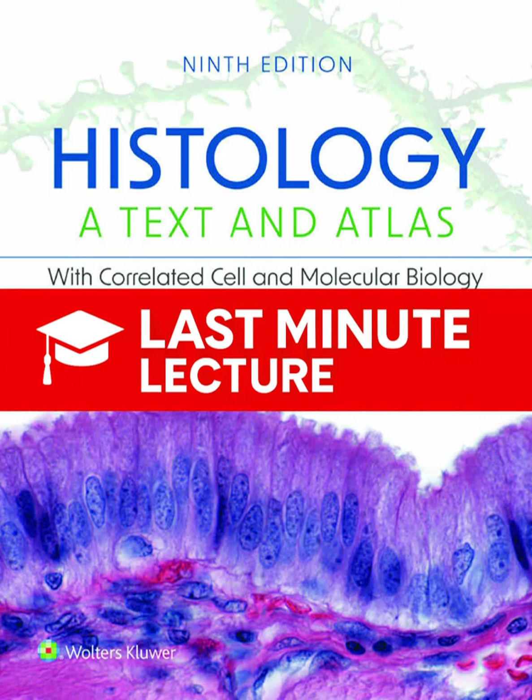The central innovation is the detector aperture, or pinhole. It's placed in a position that is conjugate or confocal with the focal point of the objective lens. And why is that pinhole so powerful? As you can see in Figure 1.13, that pinhole acts as a spatial filter. It physically blocks all the light that's scattered or emitted from structures above or below the focal plane. All that out-of-focus light gets rejected. Only the light coming precisely from the focal plane can pass through and reach the detector. And that gives you incredible clarity. Exceptional clarity.